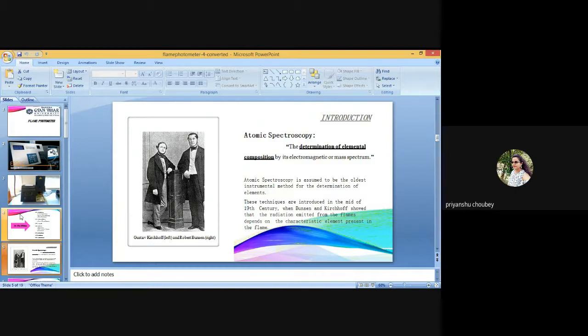light the flame. Adjust the gas control until formation of separate stable color cones in the flame without a sound. Set the galvanometer to zero by the control knob against the reagent blank solution medium.